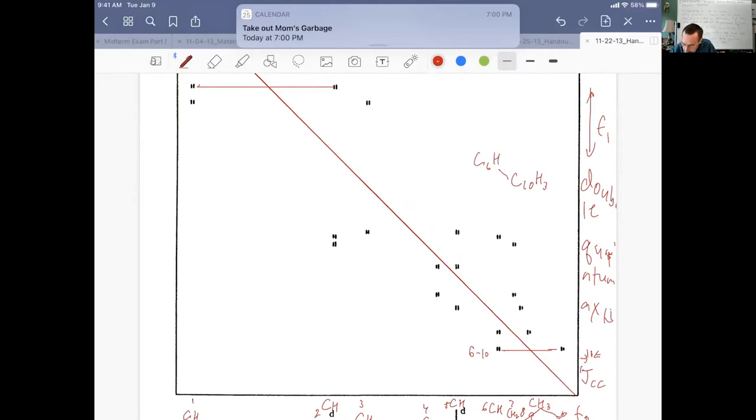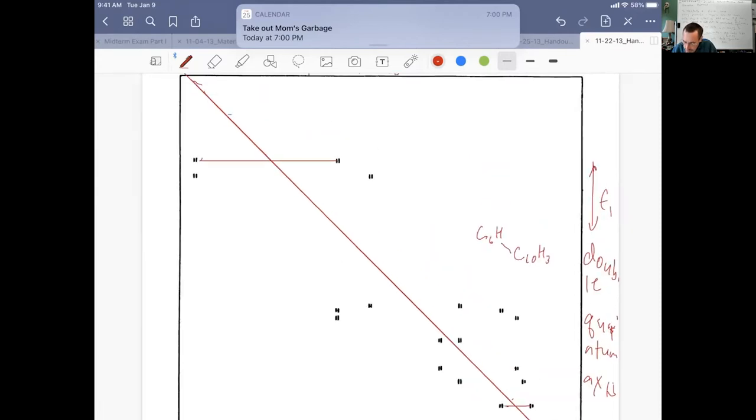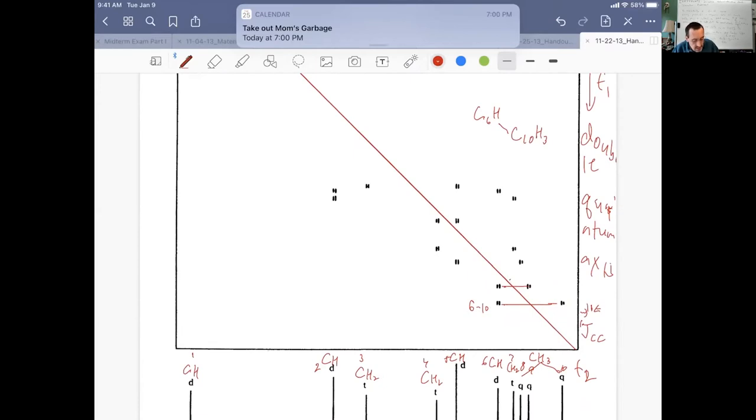Now we continue again. We see that C6 is connected to carbon 9. That's really nice. Carbon 6 is connected to carbon 9, which is a methyl group. So we built up an isopropyl group. Isopropyl groups aren't a surprise in a C10 compound. I love terpenes. Terpenes are built up of isoprene units. A C10 compound is called a monoterpene.